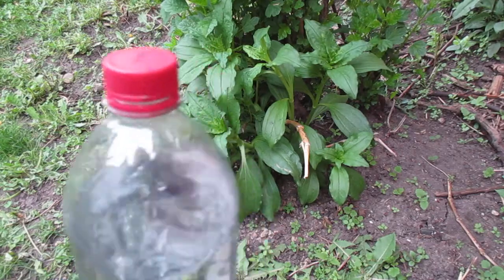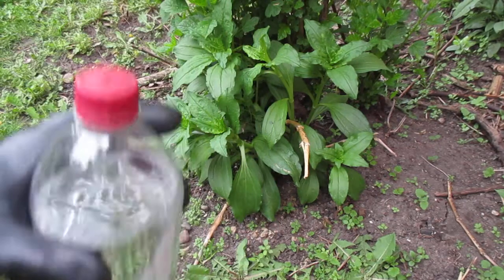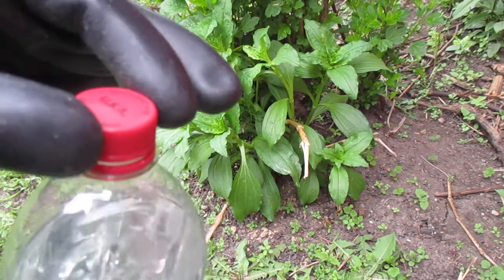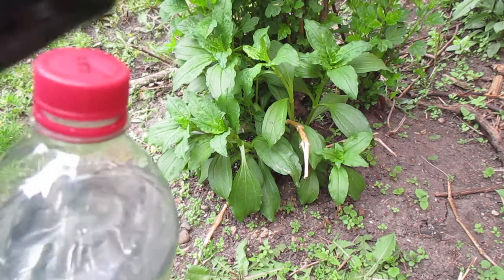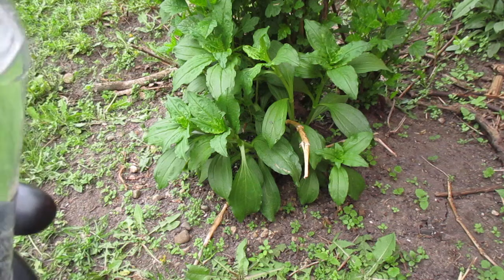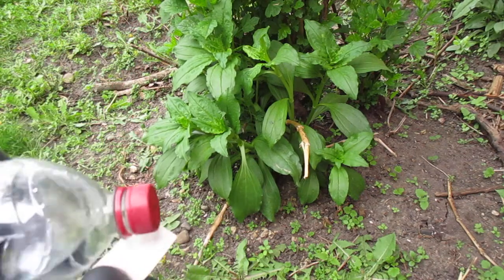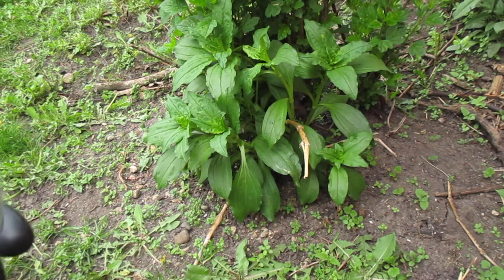When you take out the canteen, do not grab it by the cap like you may normally do. Grab it by the body, then lift it out of the carrier. Bring it forward using two fingers. Unscrew the cap just a little bit — not all the way. If water does not come out of the canteen, you can squeeze the sides a little bit and the pressure should force water out. We're checking, and this is negative.